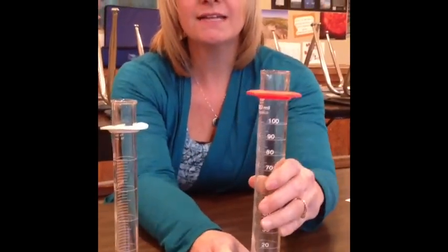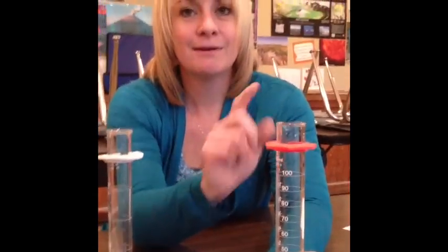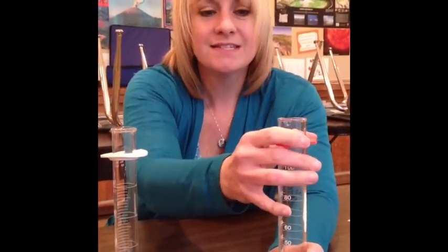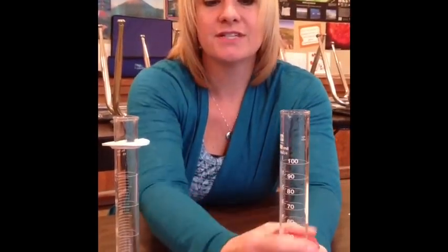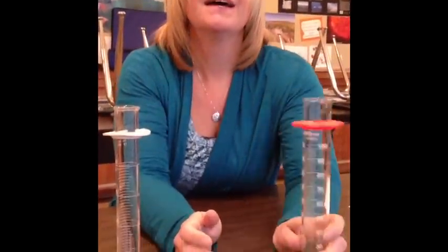But the red thing on it is also so if it falls over, bam, it hits the red, not the glass. This is not some slider to help you measure volume. It stays at the top, so bam, it doesn't break.